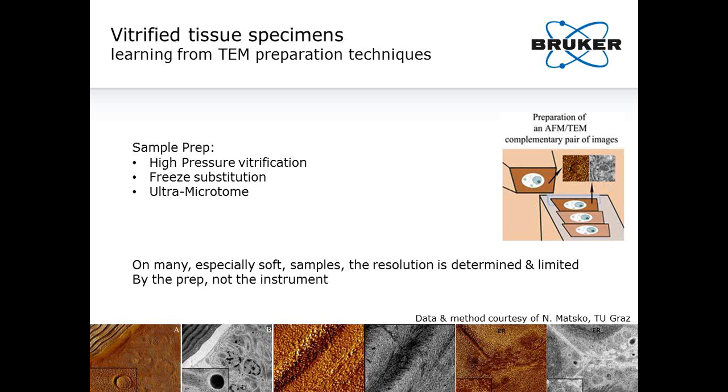In the next step, the water is substituted with a resin while in the frozen state. Finally, the sample is sectioned with an ultramicrotome. For AFM, the quality of the diamond knife is essential to avoid imaging of knife-generated topography later. Special AFM ultramicrotome knives are commercially available now.